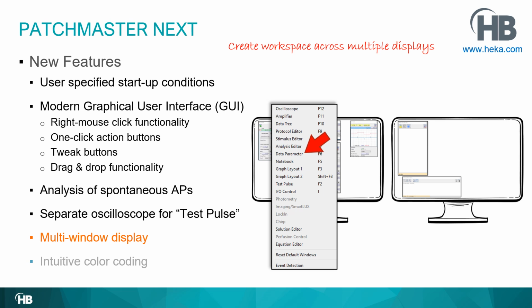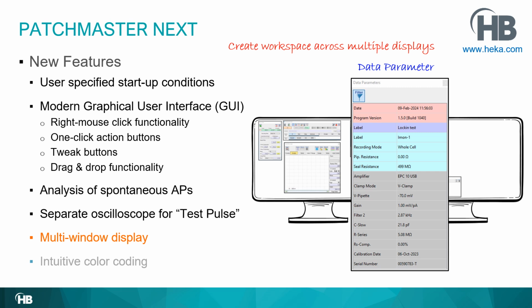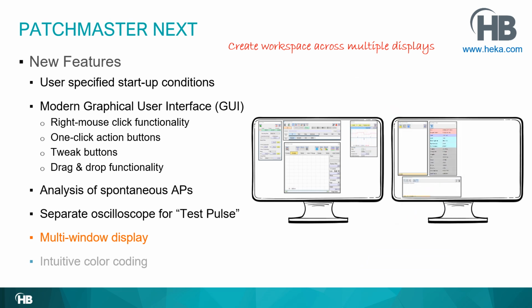For example, if you are interested in the data parameters to be displayed at all times, you click on it, the data parameter window opens up, and then you can adjust it and place it where you want it to be. You save the configuration file, and the next time you open PATCHMASTER with this configuration file, it will display like you see it now here.